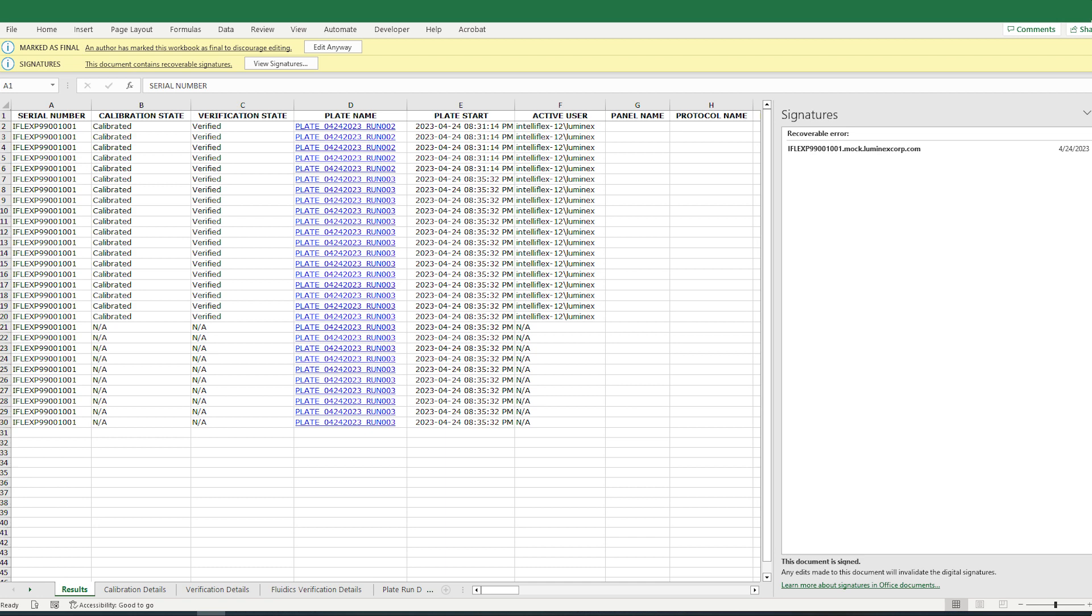Digital Signatures. XMAP IntelliFlex reports include cryptographic features that authenticate the origin of exported files and confirm that the files have not been altered after export. This helps to ensure that data isn't susceptible to corruption or manipulation.